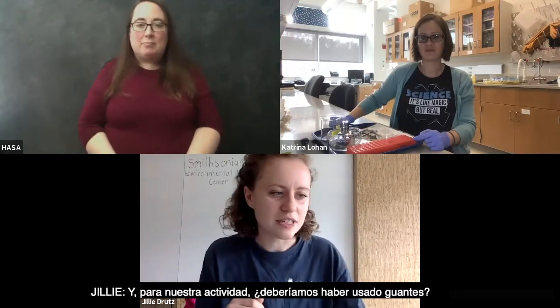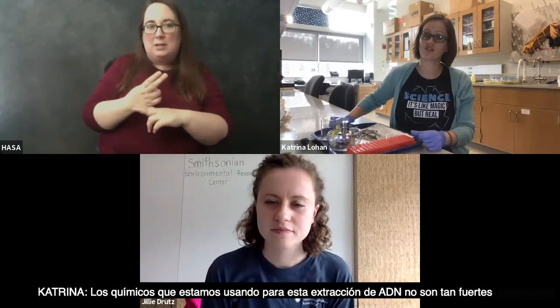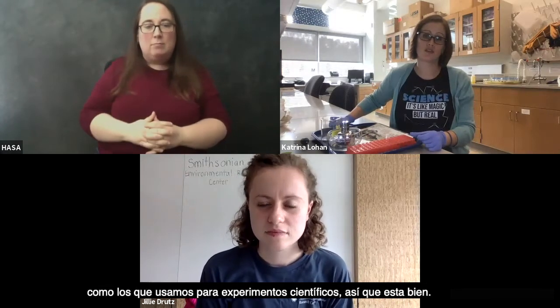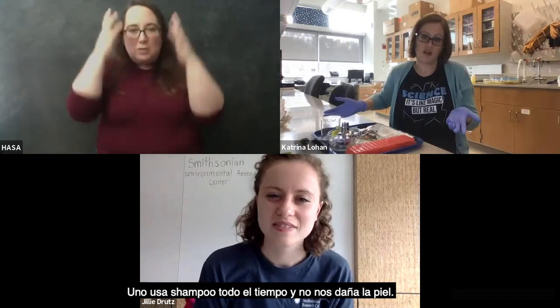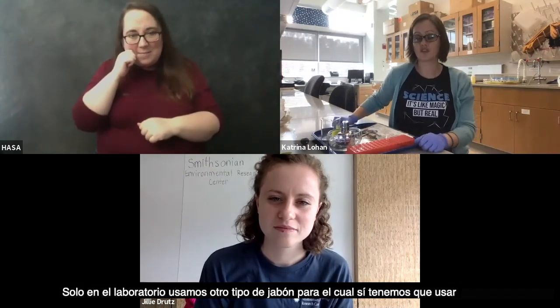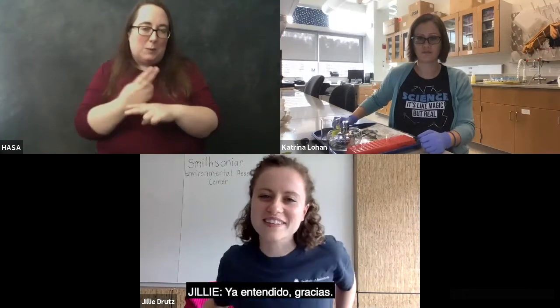So for our activity here, should we have been wearing gloves? Well, the chemicals that we're using for this DNA extraction are not as strong as what we use when we're doing this for scientific purposes. So it's okay. I mean, you use shampoo on your hair with bare hands all the time and it doesn't hurt your skin. What we're using in the lab is a different kind of soap, and that's why we have to use gloves. Gotcha. Okay, thank you.